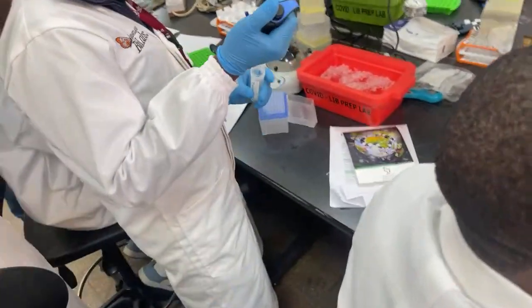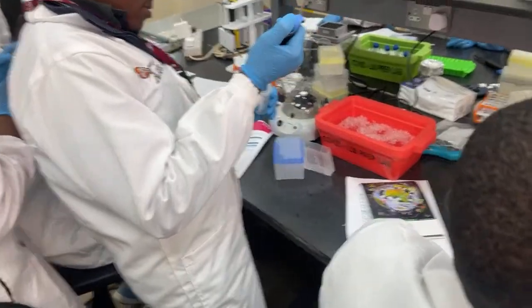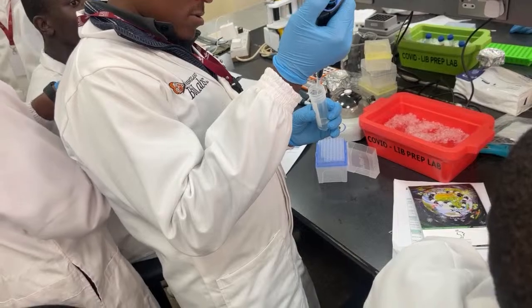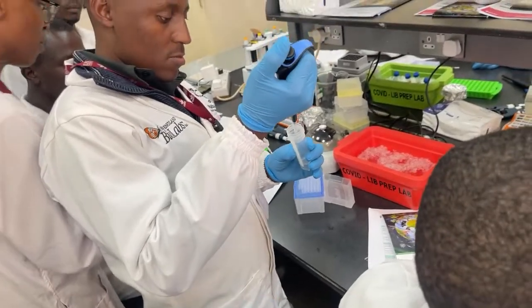Then you invert 10 times as you mix. Now I'm seeing the cloudiness. You see? You see? Where's your DNA? Yes. It's wrapping over the disk.